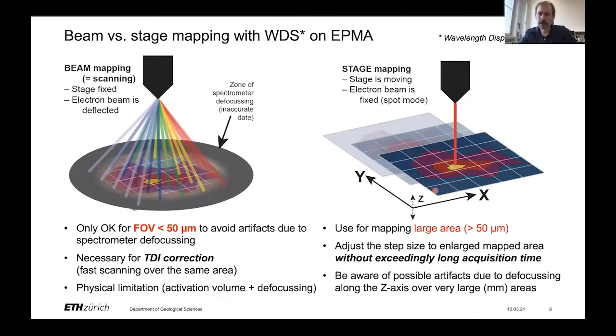You just have to be careful, of course, as you can end up with exceedingly long acquisition times. So you'll have to play with the size of your pixels, for instance.